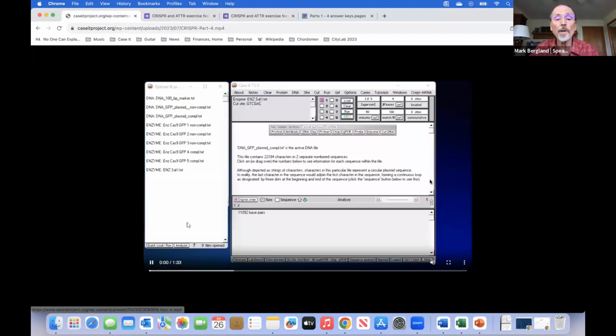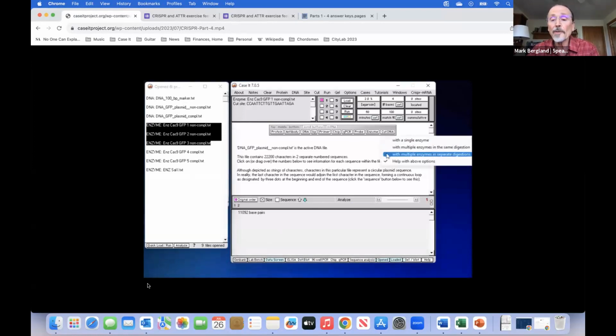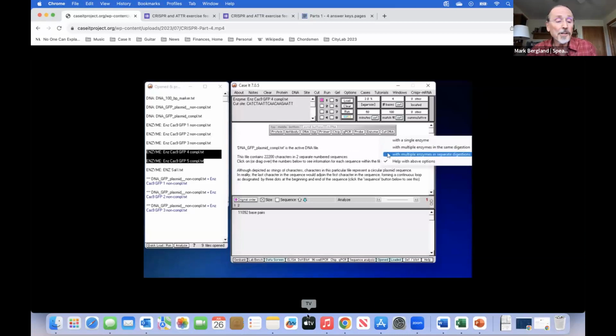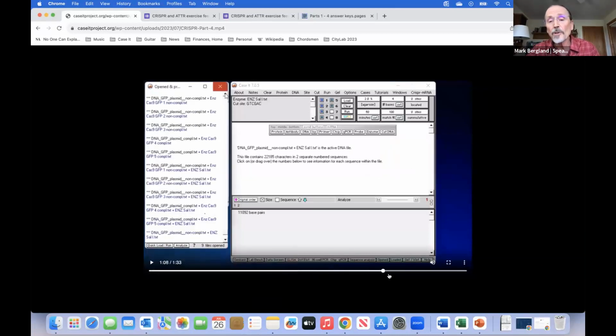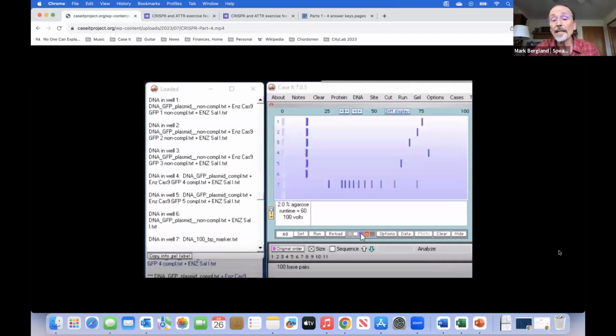So for example, here is what Ken was talking about. This is about a minute and a half. This is actually part 4. This is how you reproduce part 4. So this shows, for example, selecting the non-complementary strands and then cutting them, and then selecting a control, and cutting that with the complementary strands with a Cas9 enzyme. And since we're limited in time, I've only got about a minute, I'm just going to scroll through this quickly. But this is what the students would do with the actual software. And so I'm just going through all those steps very quickly, and then you stain it at the end.